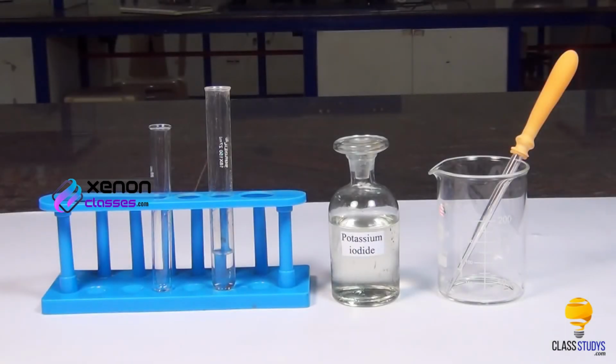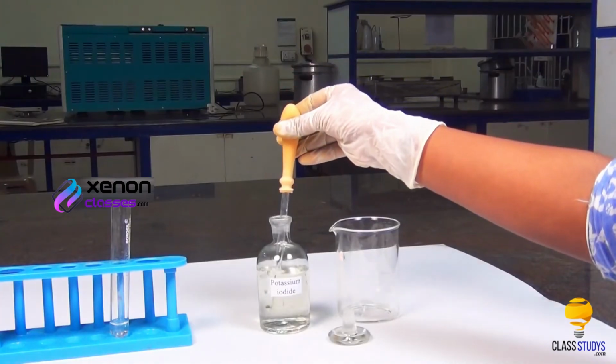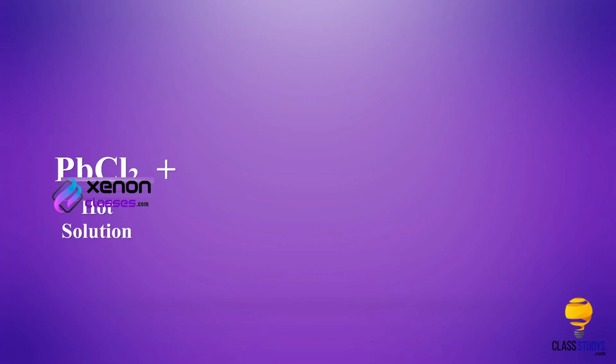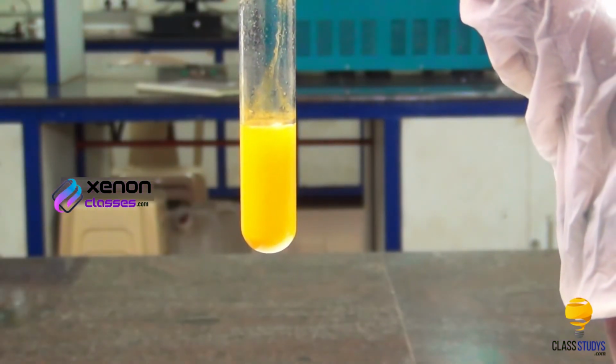Procedure. Take 1 part of the solution obtained in the group analysis in a test tube. To this, add a small quantity of potassium iodide solution using a dropper. Lead chloride present in the solution reacts with potassium iodide to form a yellow precipitate of lead iodide.